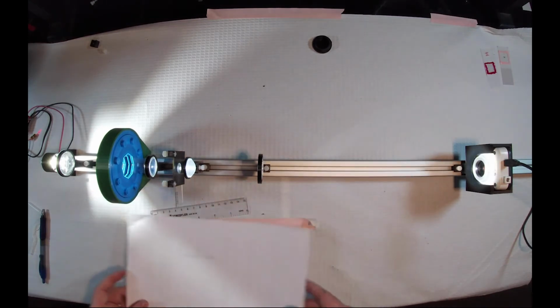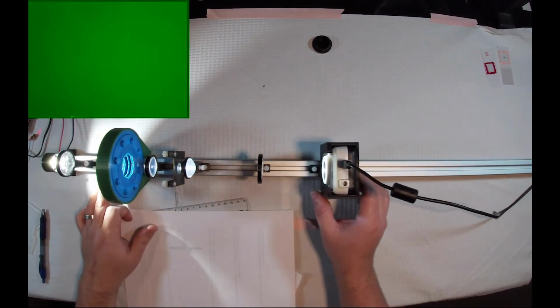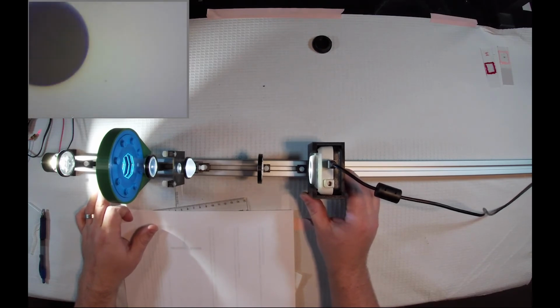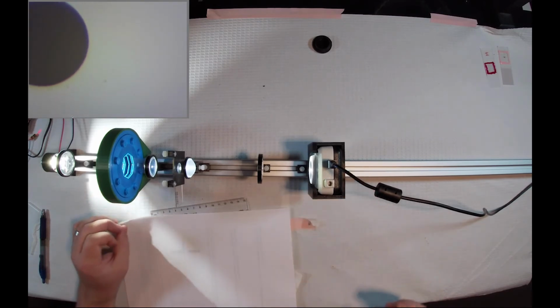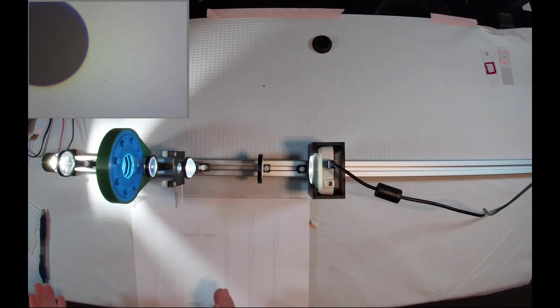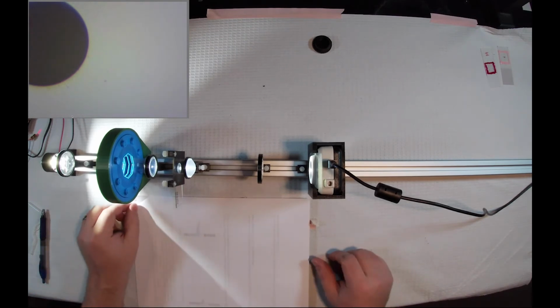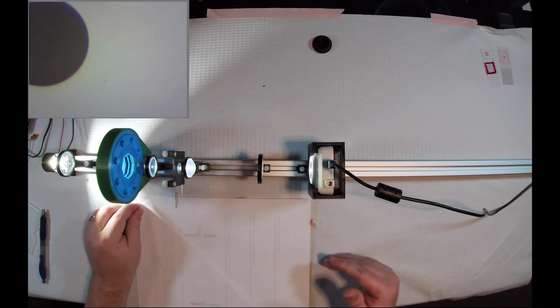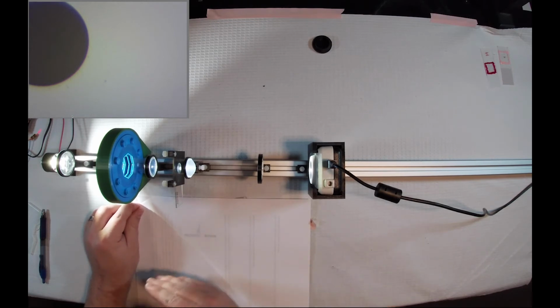So that's about right. We'll go ahead and move our camera back. Focus on our little dot there. All right. So we've found the field stop, and we have found the aperture stop of our two lens infinity corrected Köhler microscope. Now let's start thinking about, all right, what is the numerical aperture of this system?